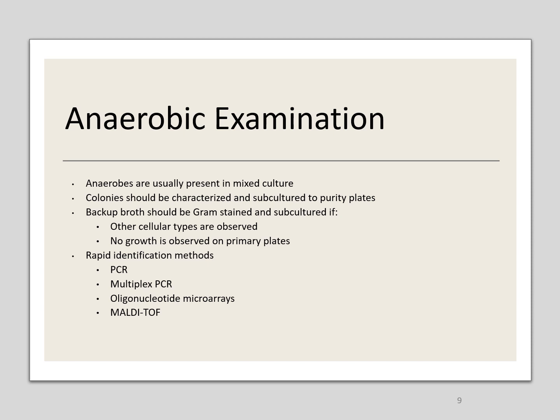And it's possible to have a couple of different anaerobes that would be the culprit of the infection. And so once you're looking at the plate and you're looking for the organisms, and you determine which ones you feel like are the pathogens or causing the infection, then you would isolate those out and do a subculture on a separate plate and regrow those organisms.